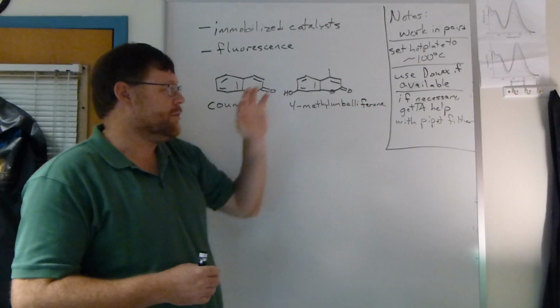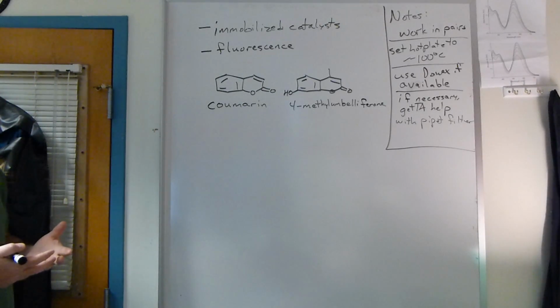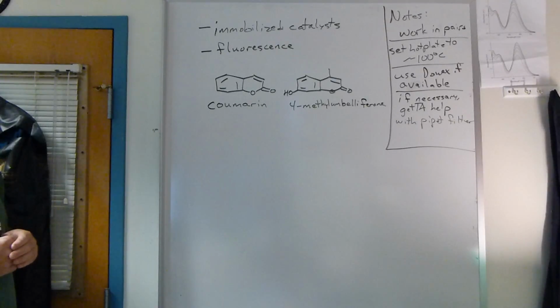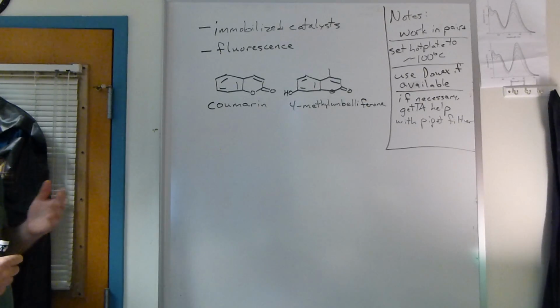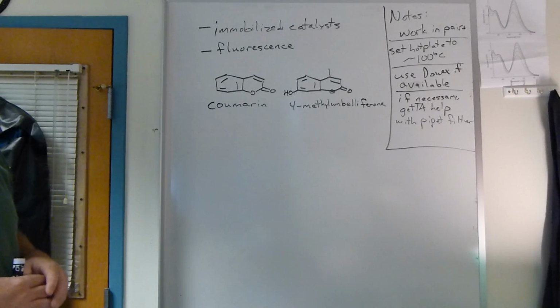You want to set your hot plate to about 100 degrees. The reaction has to get to 80 degrees C, so you want to set the hot plate a little above that. Don't crank it up all the way, but the notes from previous years say that a lot of times people don't get it hot enough.